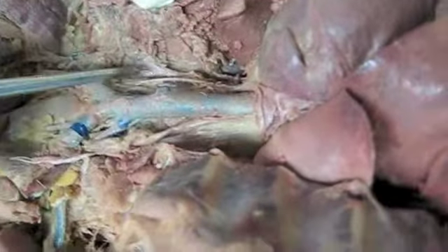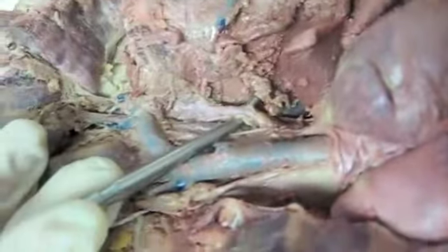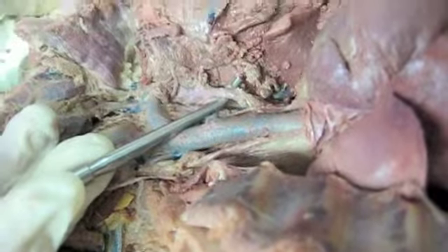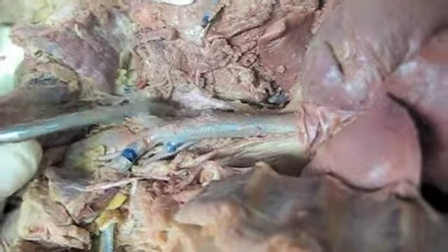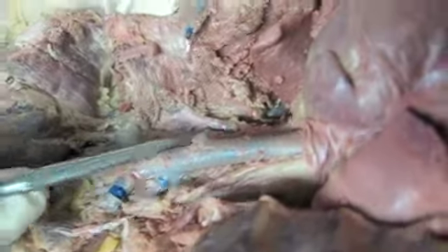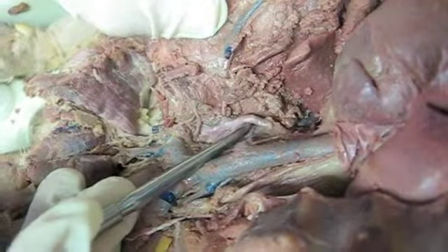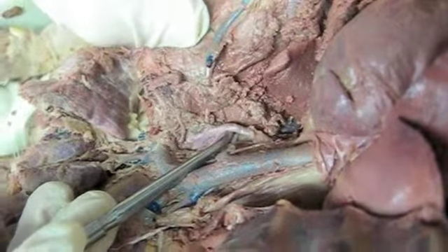The other artery over here that's coming off independently off the arch of the aorta is your left subclavian. And then there are going to be three branches off that left subclavian. These are small, and the first one is hard to show. Anyway, it's coming off right there and going down deep. When I pull this up, you can see that there's an artery right there. That's going to be the vertebral artery.